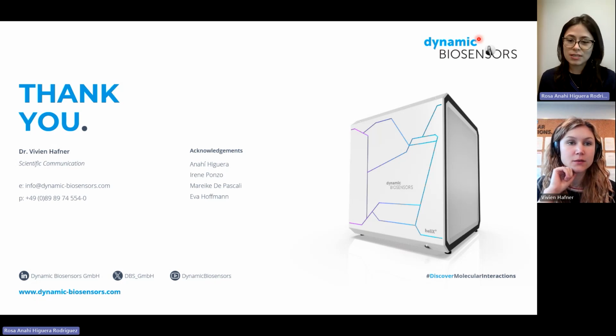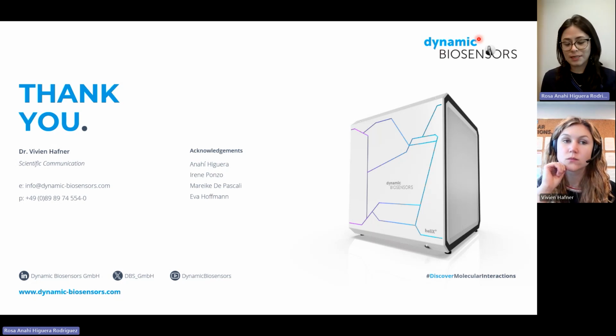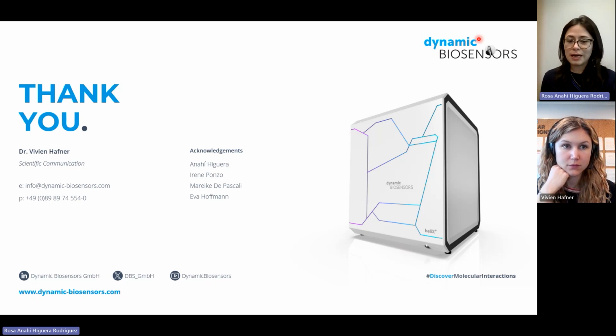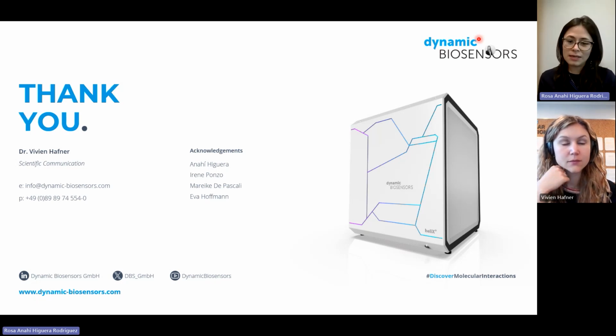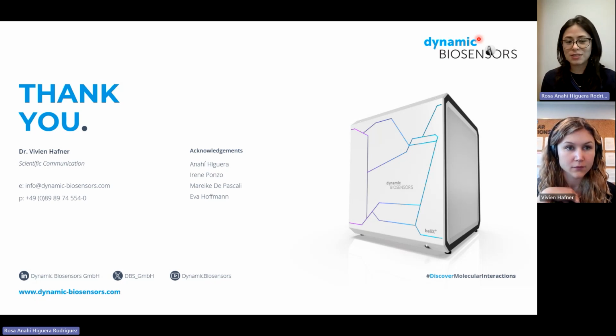What distance change? I think this is also related to what I just mentioned. So the distances that we are able to differentiate are lower than 100, 150 nanometers in length. So I think everything around that would be possible. Of course, very small changes of, let's say, 1, 2, 3 nanometers, that is not resolvable, but you would see a change whenever the distance or the building of the bases is more.